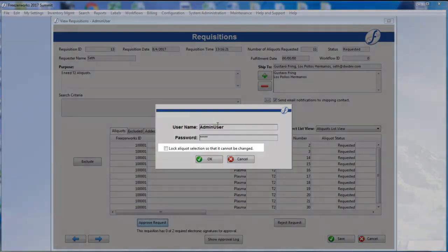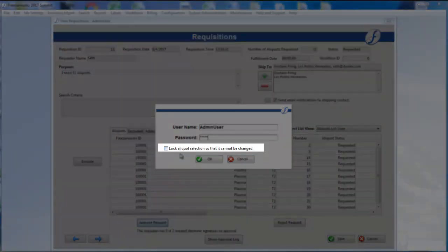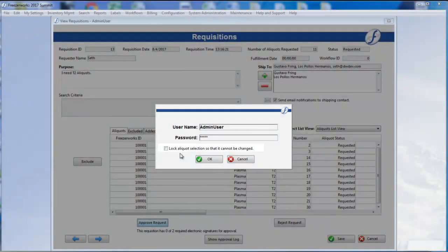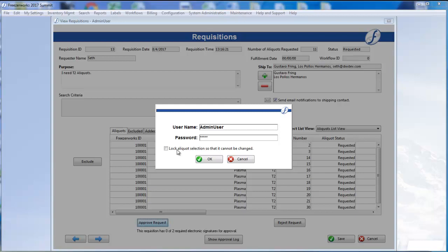Take note of the lock aliquot selection so that it cannot be changed box, as this will make sure that the requisition will remain the same after your approval. We'll check it on, and click OK.